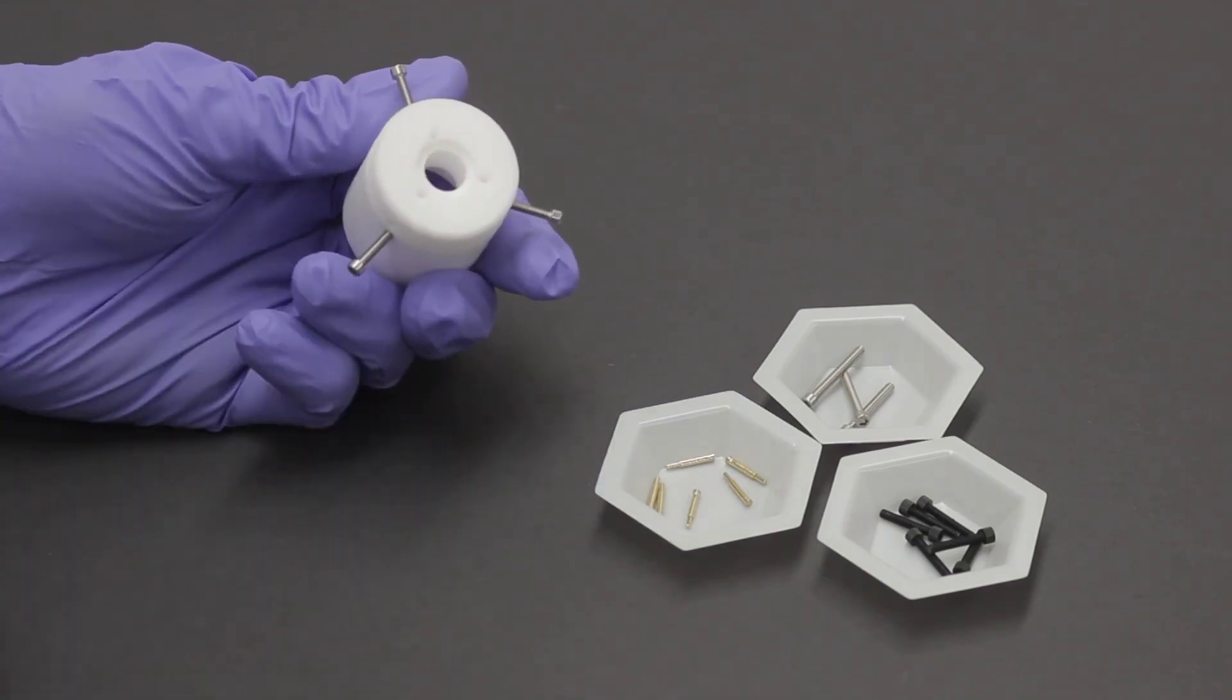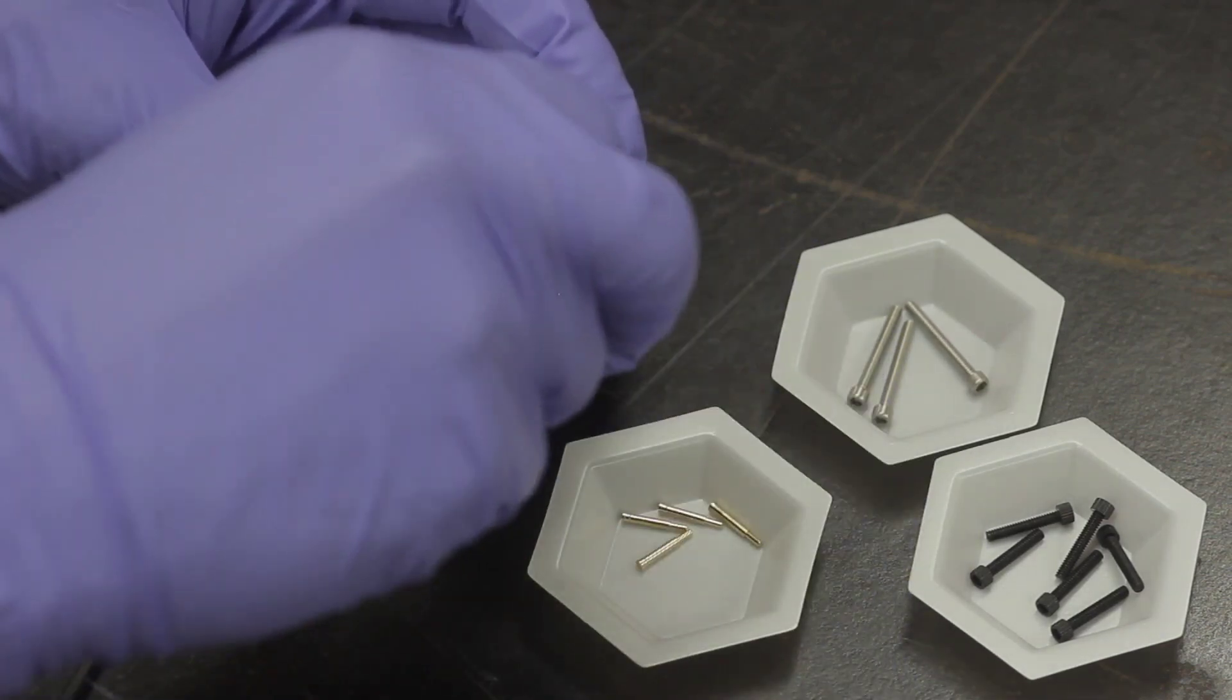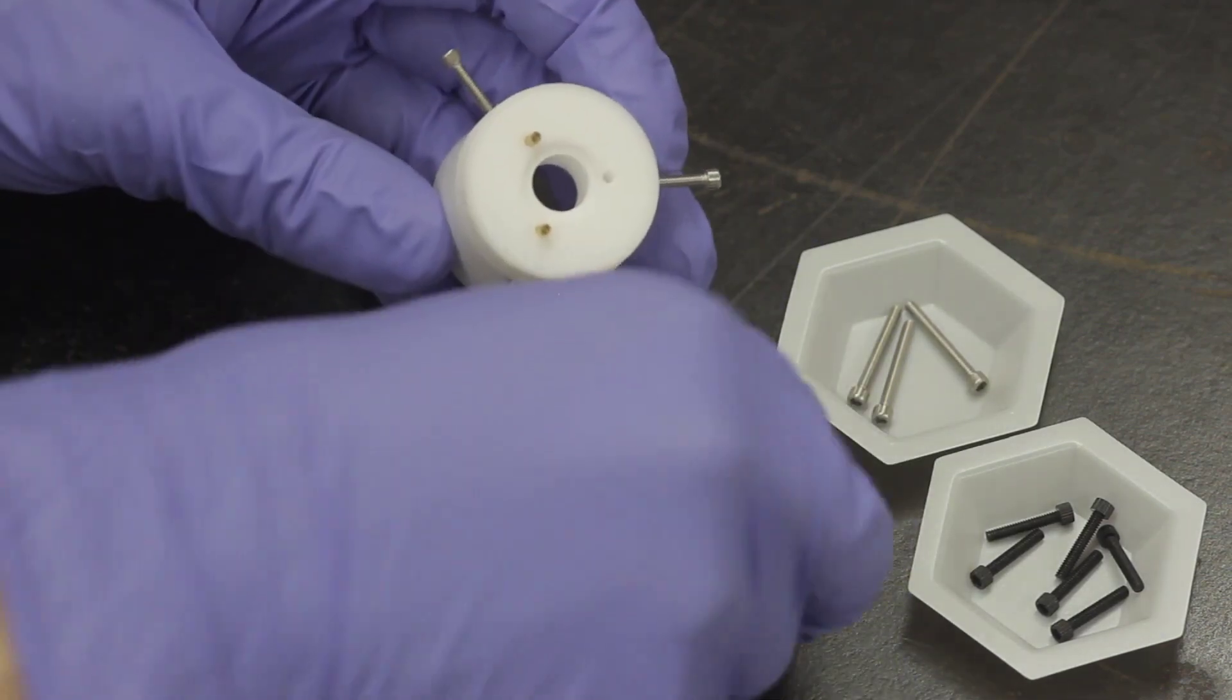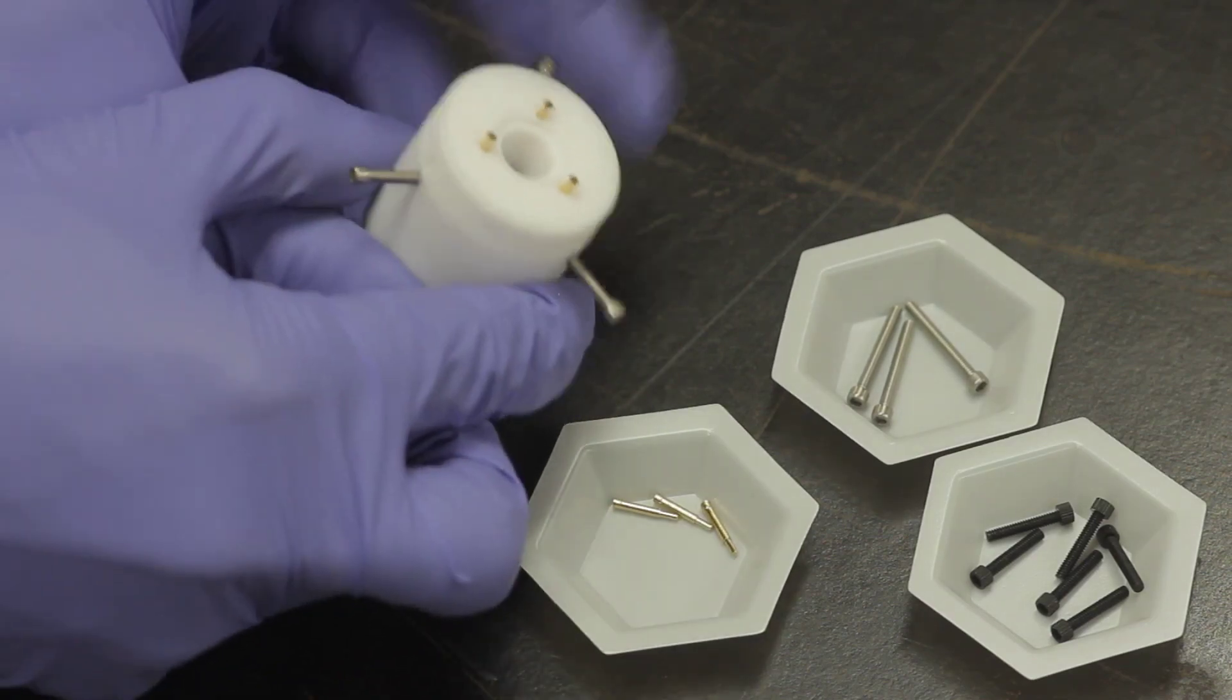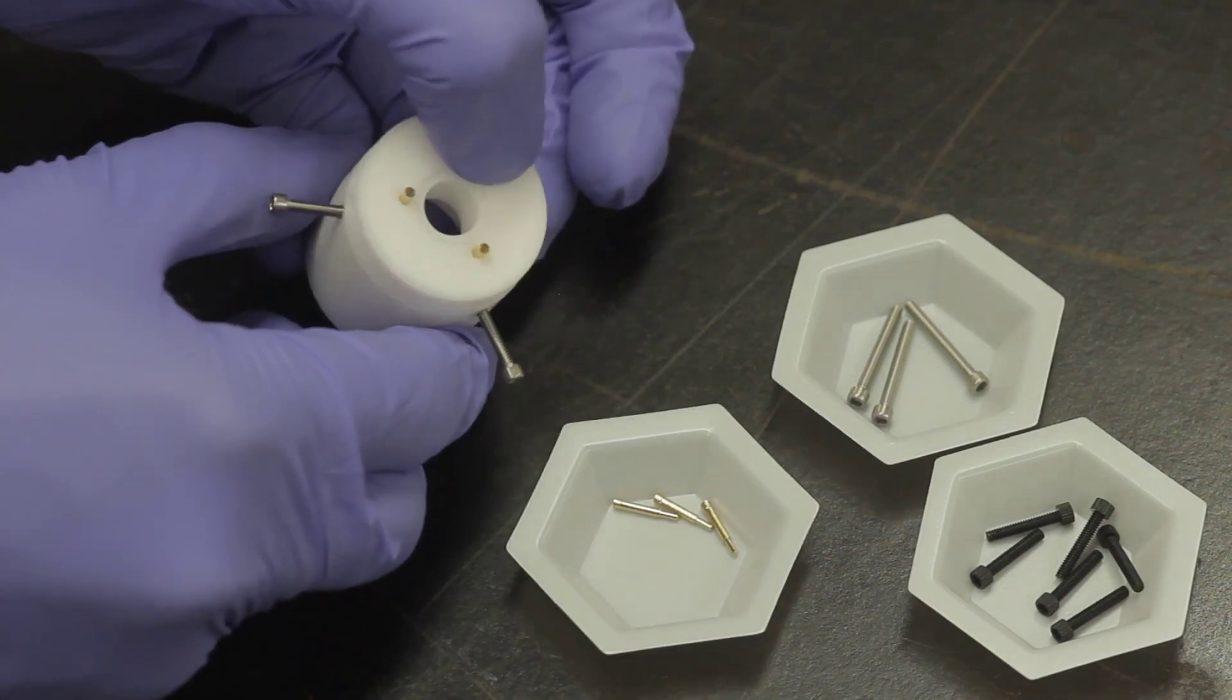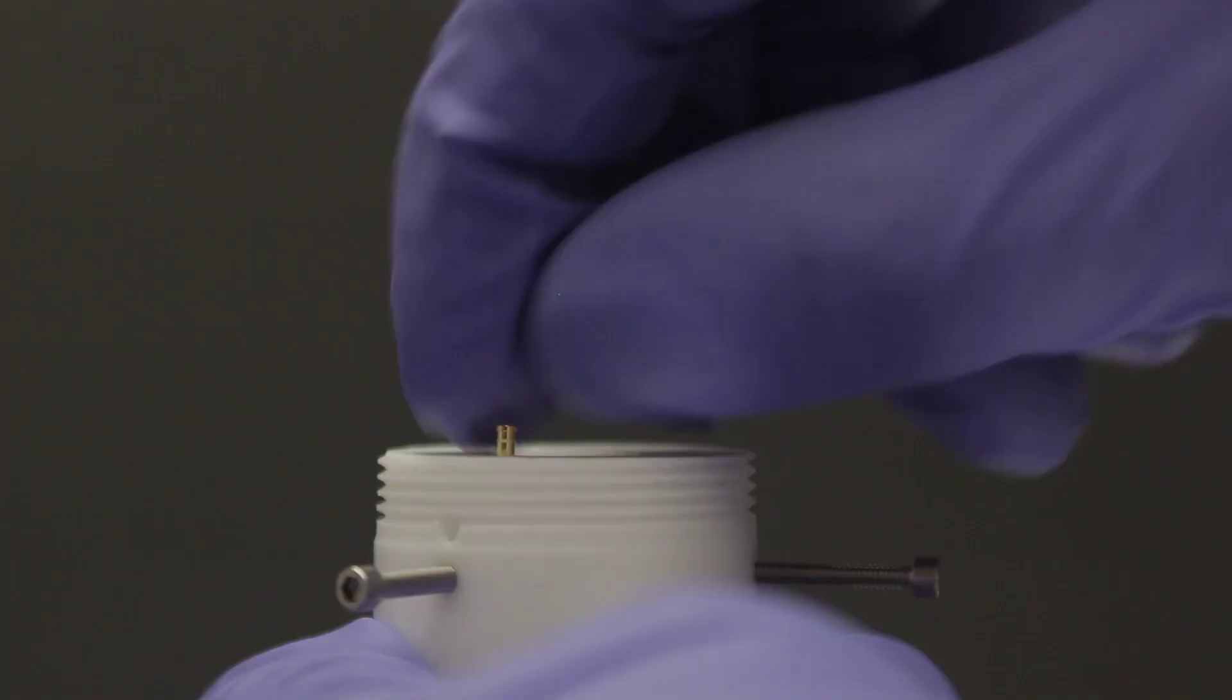Next, install a spring-loaded pin into each of the holes in the bottom of the cell base. The pins should protrude upwards from the surface. Check the spring action by depressing each pin. It should compress easily and extend as soon as pressure is removed.